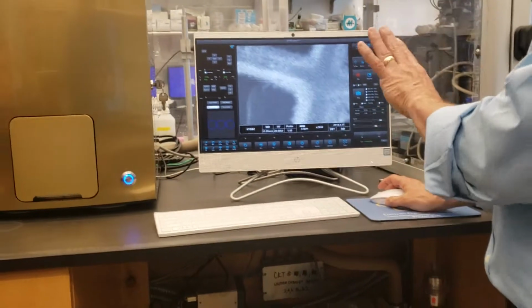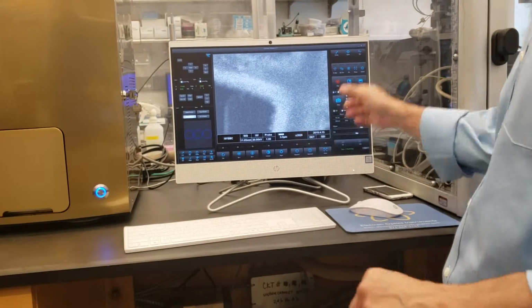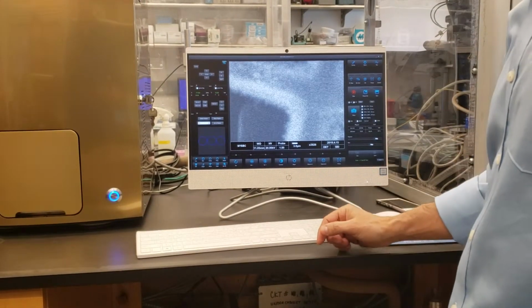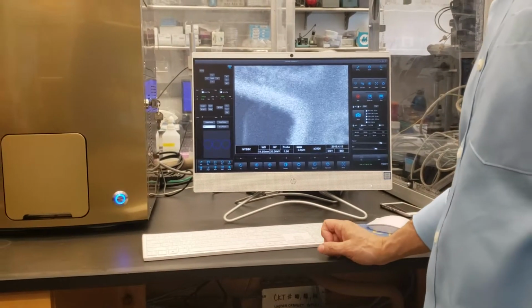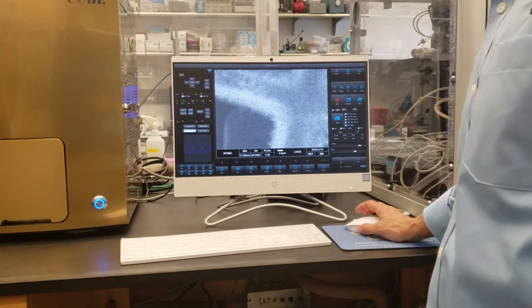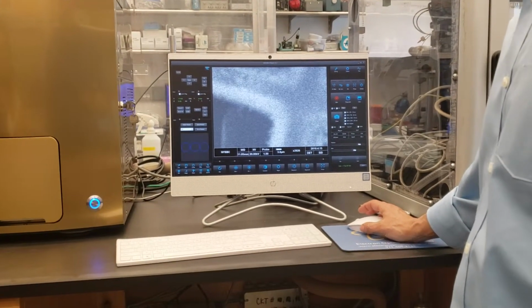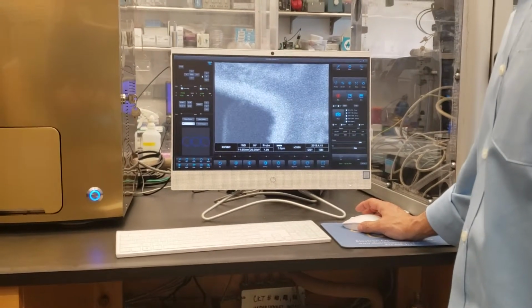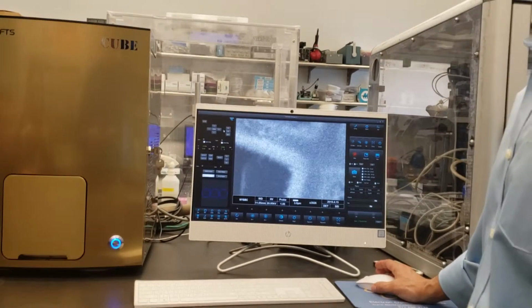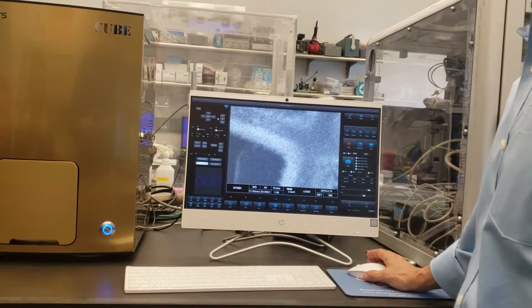We're not focused right now, so I'm just doing this step by step. All I did was hit run, and I'm just going over the stage menu right now. It's the same with tilted stage. It will just go back to whatever position you're at. It doesn't matter, it just remembers the coordinates. So again, the coordinates are X, Y, Z. That's correct, 3 points.